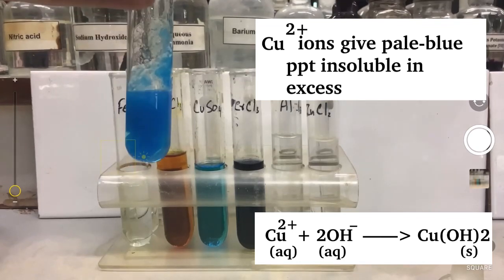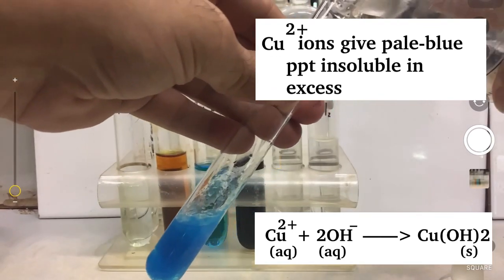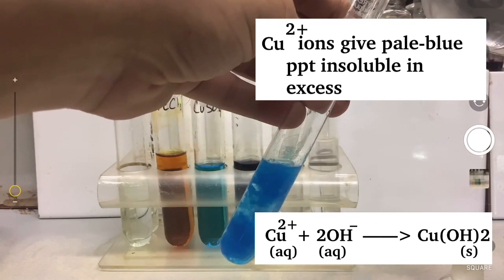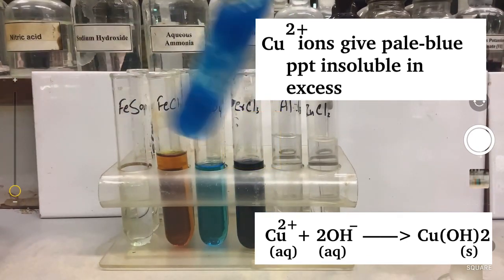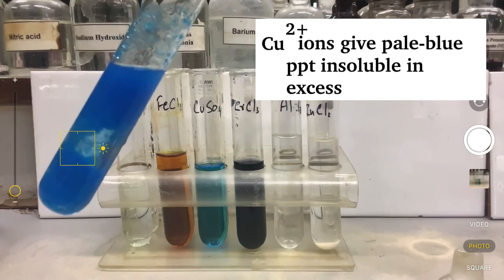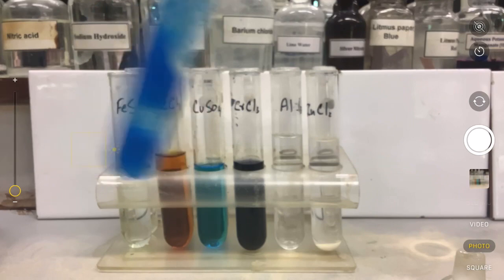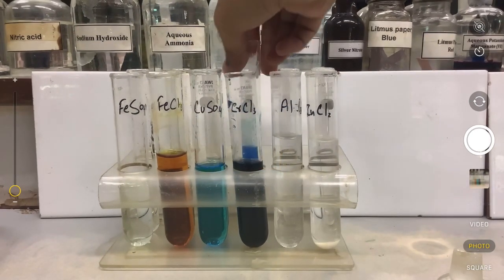So the copper 2 ions react with hydroxide ions to make copper 2 hydroxide. But if I add excess sodium hydroxide, the precipitates do not dissolve. So precipitates are insoluble in excess. This is the first of the tests for copper 2 ions. Let's perform a similar kind of testing, this time with aqueous ammonia.